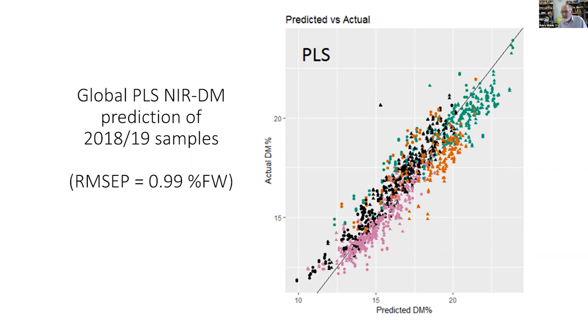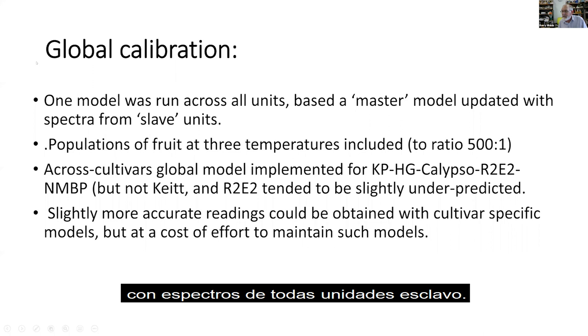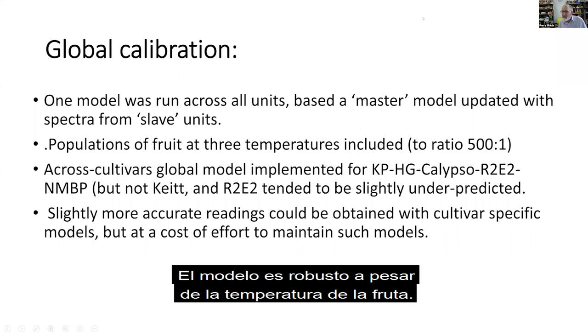Yes, and jumping on. So that's just summarizing that again. We are running one model across all units based on a master model updated with spectra from the slave units. We do include fruit at different temperatures with a ratio of about 500:1 of fruit at single temperature versus different temperatures. So the models are robust regardless of the fruit temperature.